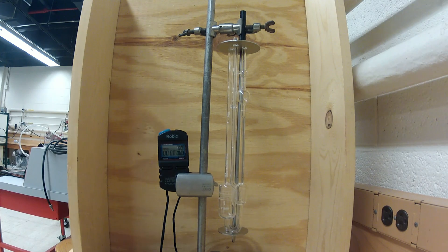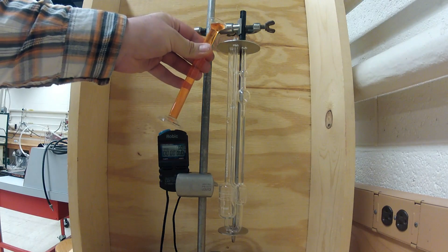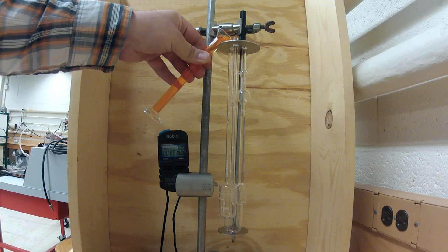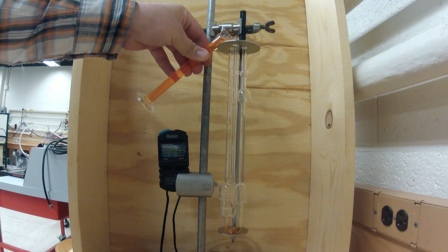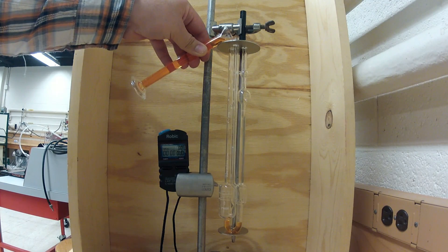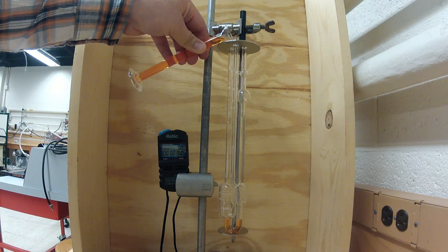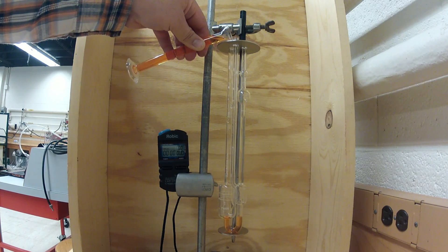First, you will want to measure 15 milliliters of the test fluid using a graduated cylinder as shown. You will then pour the contents of the graduated cylinder into tube one of the viscometer. This is the largest tube of the viscometer and it is directly linked to the reservoir on the bottom of the viscometer.